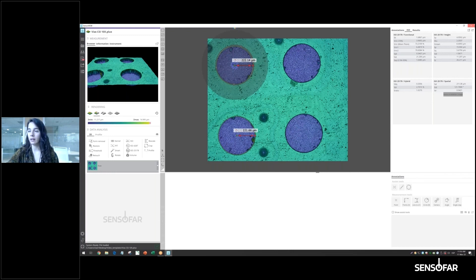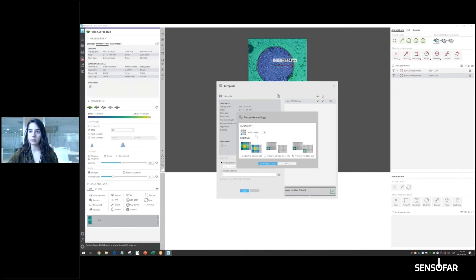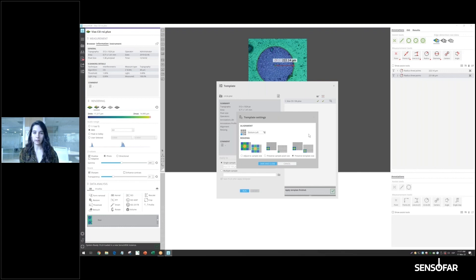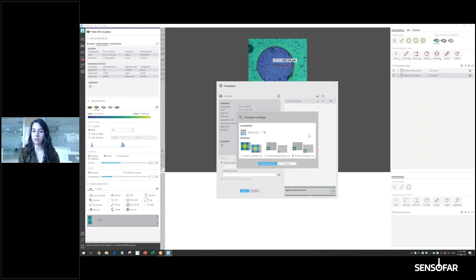Those are the special cases where you need to consider the alignment options — otherwise you don't need to touch them. This is pretty much everything for this tutorial on templates. I hope you liked it and I recommend staying tuned to new versions of SensoVIEW, as we're going to have more and more automation in these templates. See you in following videos.